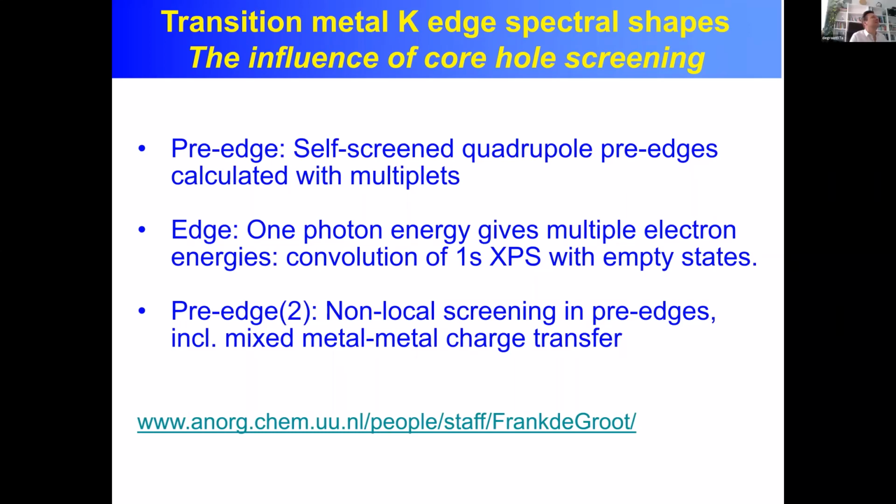Yeah, it could be. The story of shake up and shake down is for me very confusing. What exactly do people mean? In my interpretation, shake up is the same as charge transfer in oxides. Of course, it's different in atoms, but in transition metal oxides. I'm not sure if it has been assigned. If it's very close, I think people tend to assign it to crystal field energy.